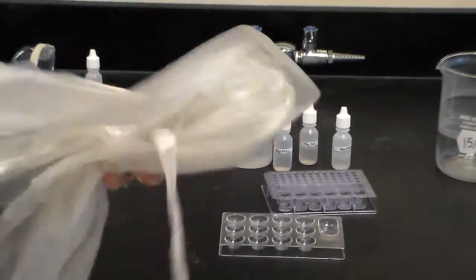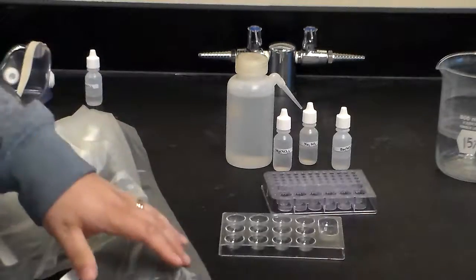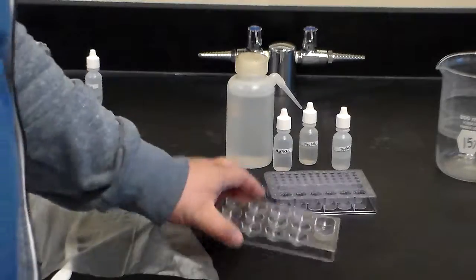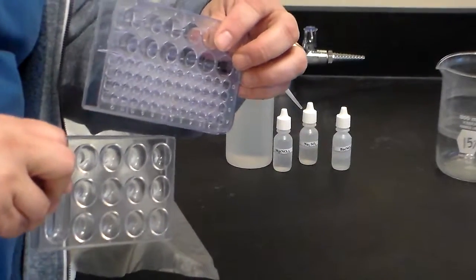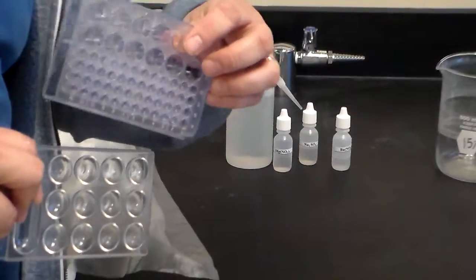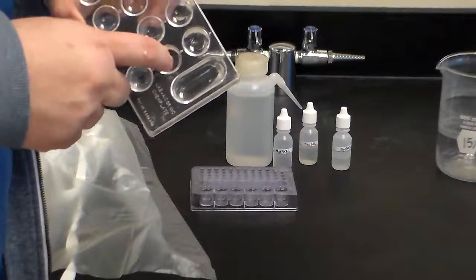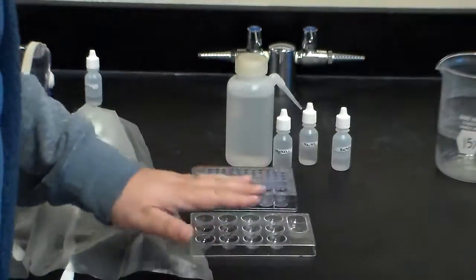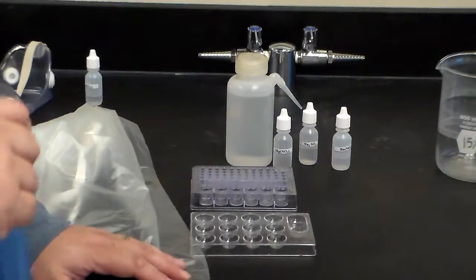Safety gear, going to need the apron, we're going to need the goggles because we are working with different chemicals as a safety issue. Now, your group will either get one of these two well plates. We say well plates, not well as in you're not sick, but well that if you take a close look, there's a little depression in there. It's like a little hole. So that's what we're going to run the tests on. This is what we would call microscale chemistry.